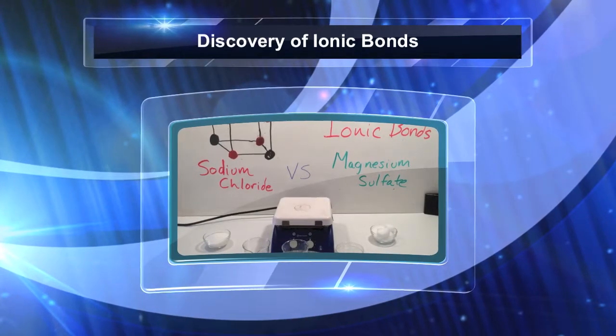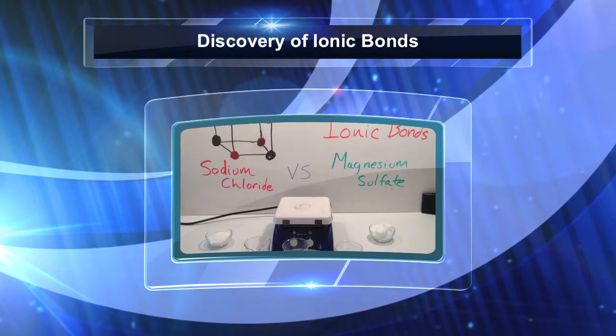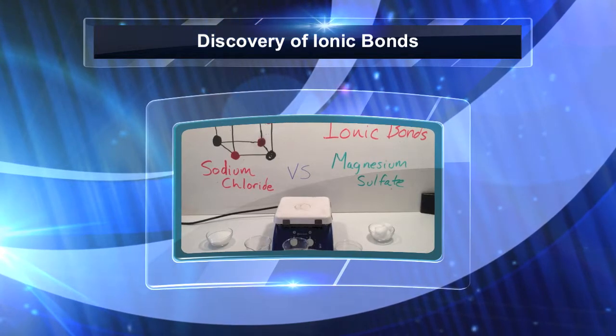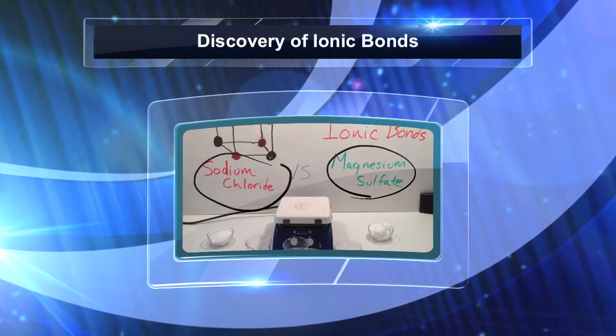Today we're going to learn about discovering ionic bonds, and we're going to use magnesium sulfate and sodium chloride.